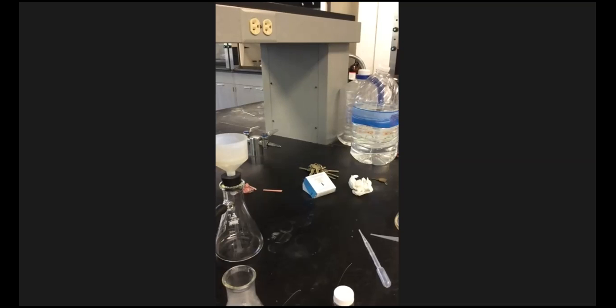All right. So we're gonna do the vacuum filtration. We already got the rinse water. I heated that up already, so we're good on that. We're gonna go ahead and do the vacuum filtration. I'm gonna let it cool down for about a minute or 2 minutes. Let it cool down for about 2 minutes.